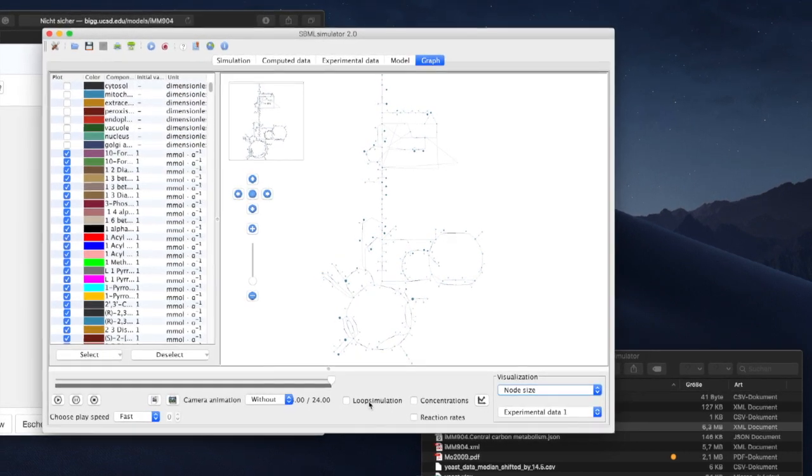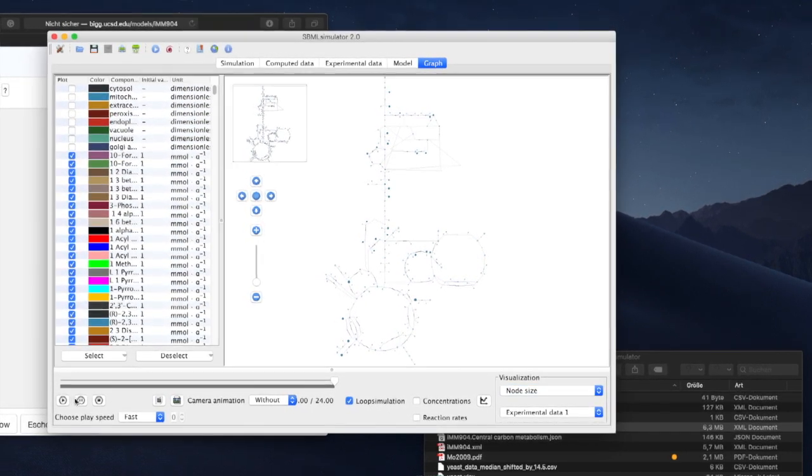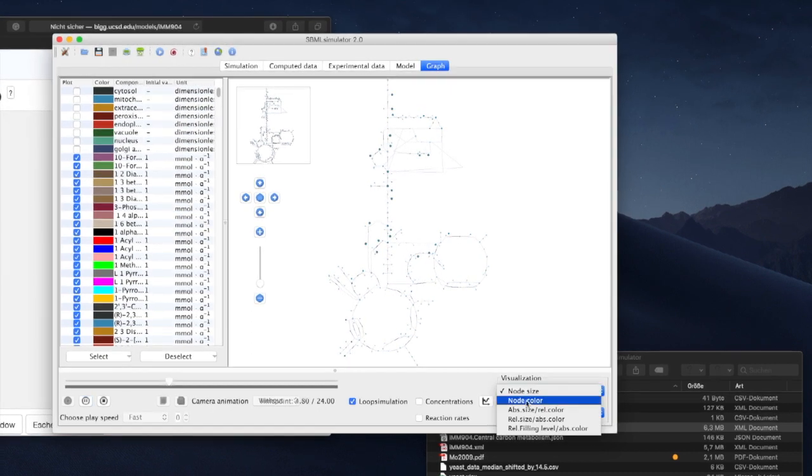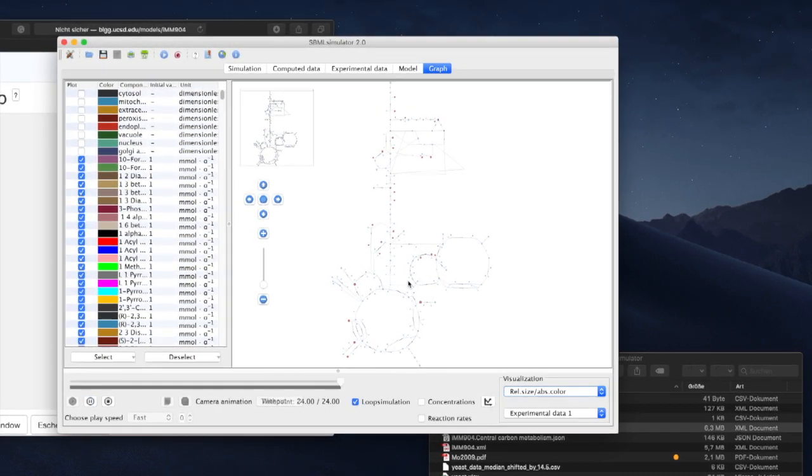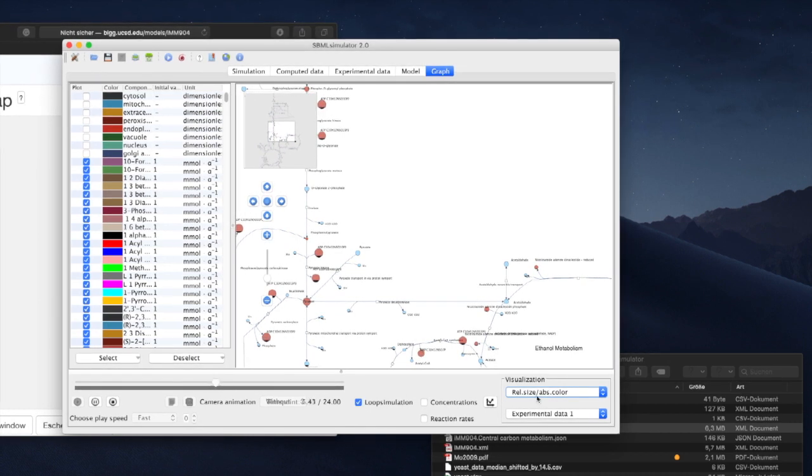This checkbox allows us to create a repeated animation, and we can pan and zoom while it is running. And we can change the visualization style.